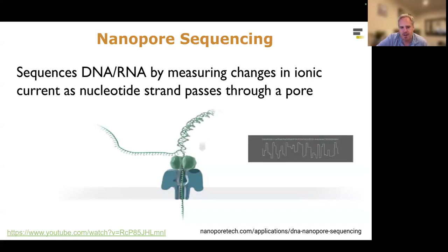Today, with modern base callers using recurrent neural networks or transformers, the modal accuracy is something like 99% or better. Although you do get a bit of a tail where some of the reads will only be 98% or 97%, down to 95%. You can often detect when reads have lower accuracy, since you'll get a quality value measurement. It's very common to filter out very low accuracy reads from your de novo assembly, and preferentially prefer reads that are higher accuracy and longer. So if you can collect reads that are 100 kb and more than 99% accurate, that's outstanding data for de novo assembly. You're going to get a really high quality assembly out using such data.